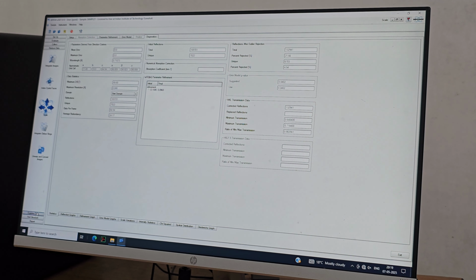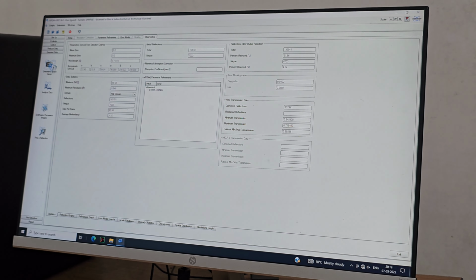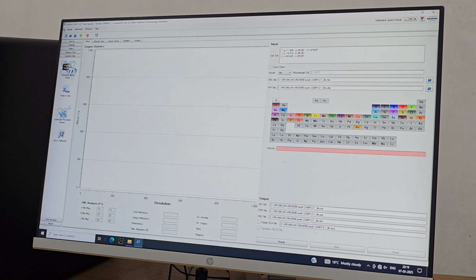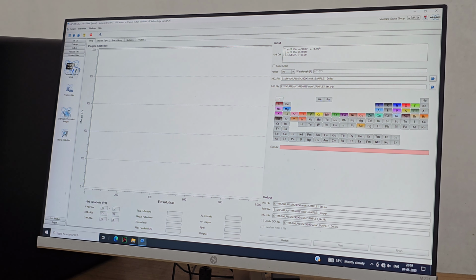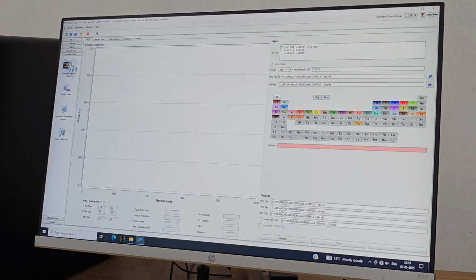After that, next go to the examine data. In examine data there are several tabs like determine space group, analyze data in XPREP. Both can be used to determine unit cell. So we go to the determine space group.